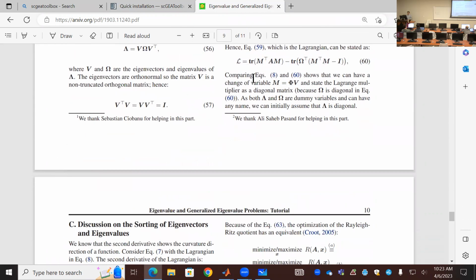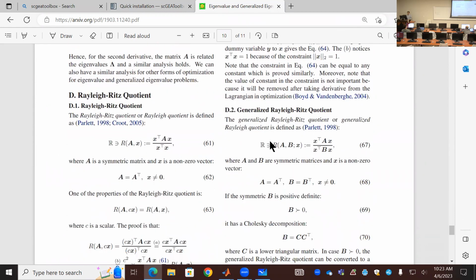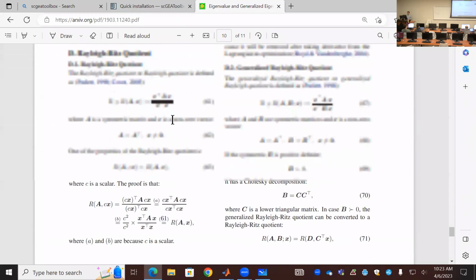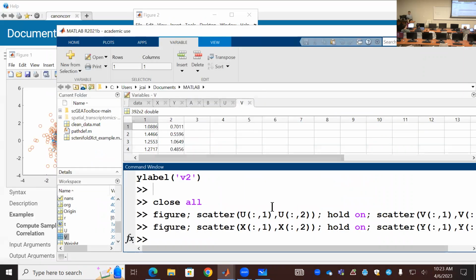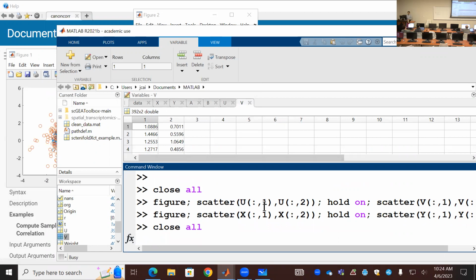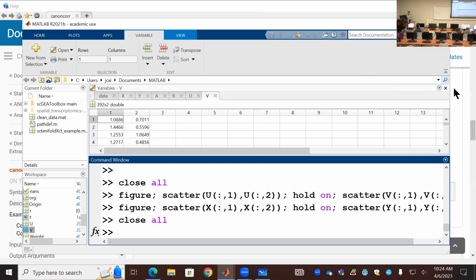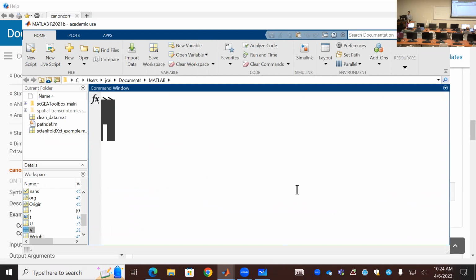Yeah, this is very... okay. I will talk about this later, maybe. Okay, so let's stop this, close all, and we are going to look at another function, DTW.